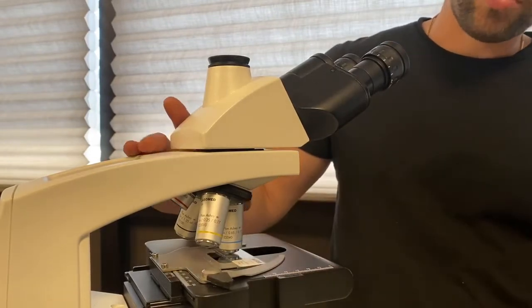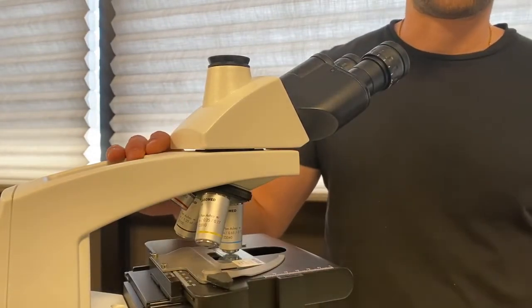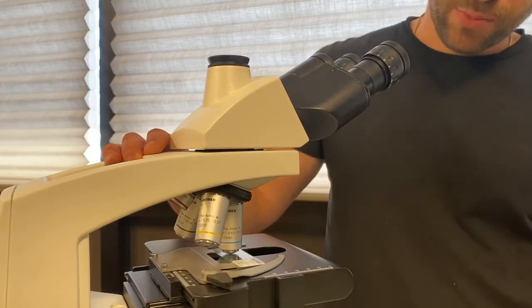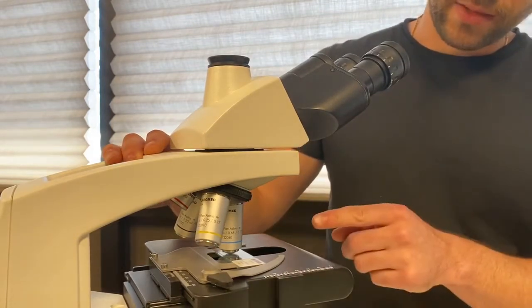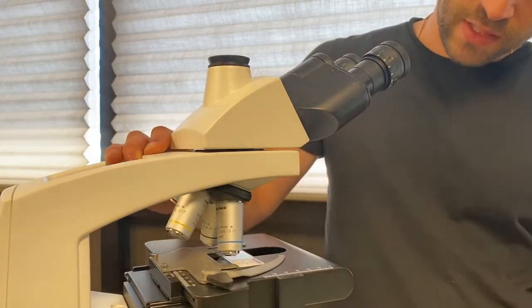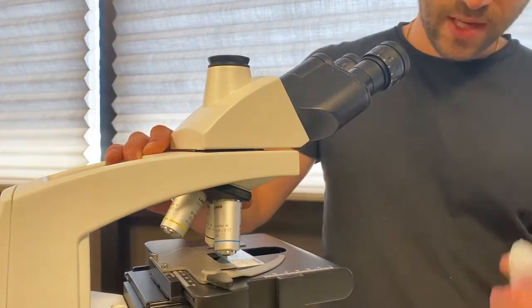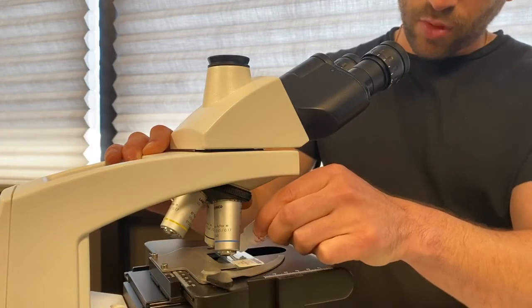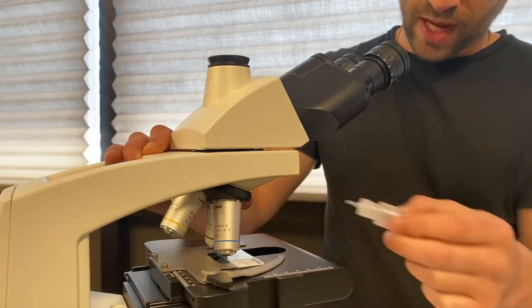When you use a 100x objective, you need to apply a drop of oil to the top of your coverslip. After you get your sample into focus with your 40x objective and you're ready to move on to your 100x, simply rotate the nose piece so they're in between objectives, take your bottle of oil, and apply a small drop to the top of the coverslip.